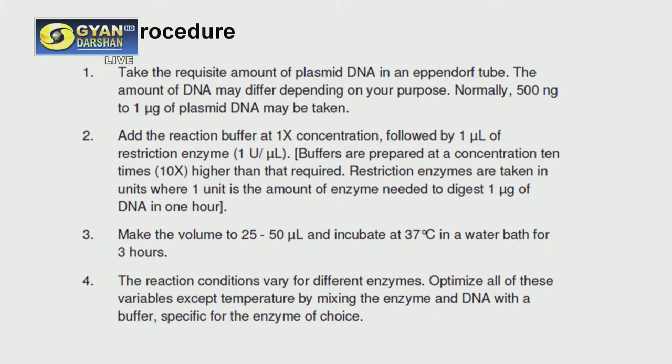And now you have to incubate the reaction mixture at 37 degrees centigrade for 3 hours. Sometimes in certain cases, like if you are digesting a genomic DNA and not a plasmid DNA, you might have to increase the incubation period. Sometimes even overnight, you might have to incubate the reaction mixture. But for plasmid DNA, normally the incubation time is 3 hours, maximum 3.5 hours.